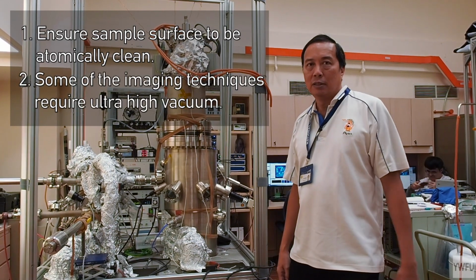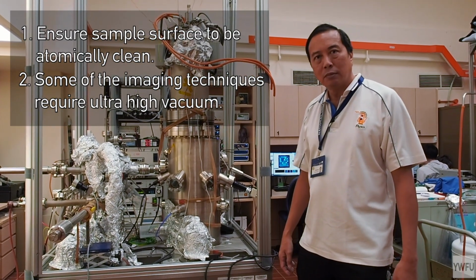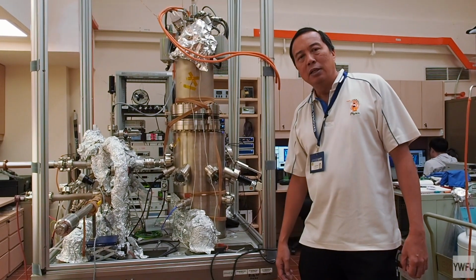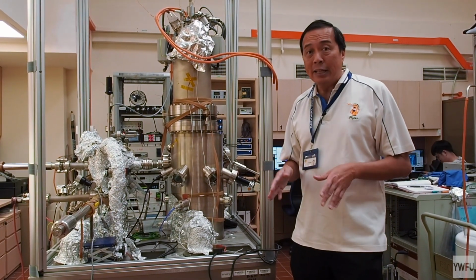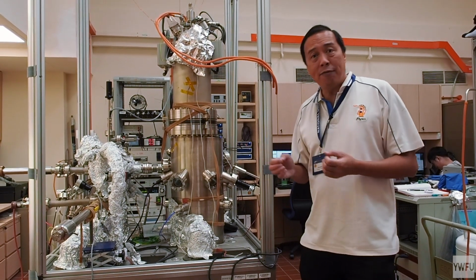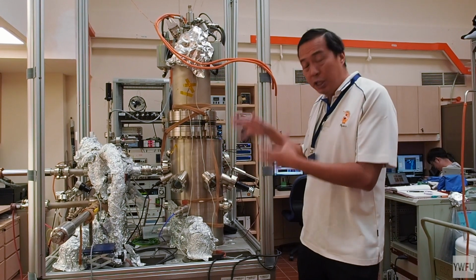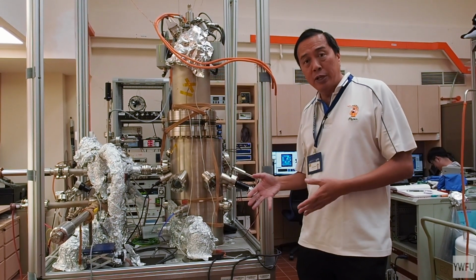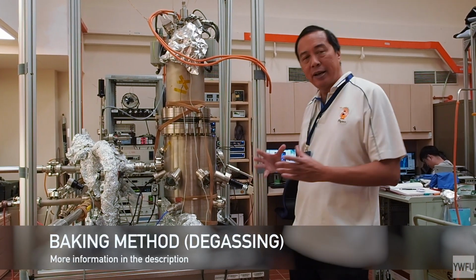I see. So I noticed that there are a few pieces of aluminum foil on the machine. What are those? Yes. In order to achieve ultra-high vacuum, which is about 10 to the minus 10 millibar, we have to pump this whole system in 3 stages. And in addition to that, we have to bake the entire system. It's just like putting the whole system in an oven.